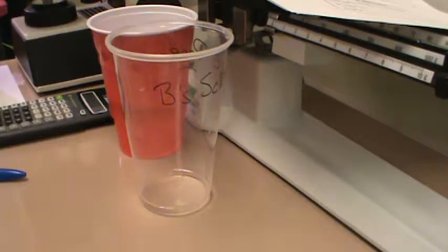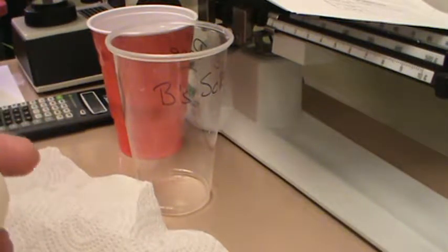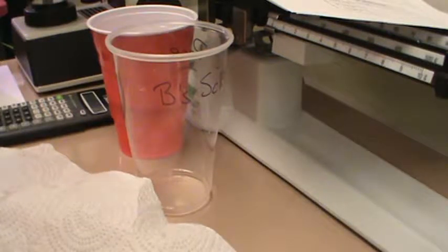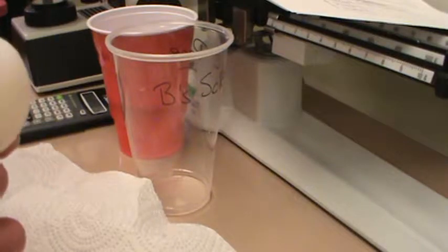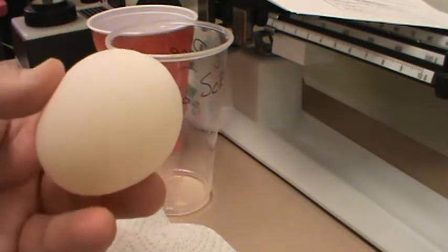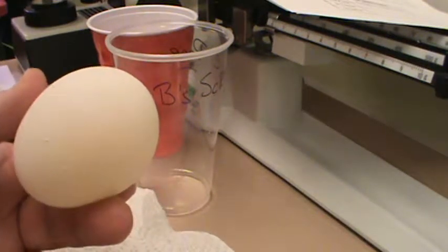And my theory, because I've never done this experiment before, was that the yolk and the albumin had been liquefied in a reaction with the vinegar, and I think I've stated that. In doing some further research, come to find out the yolk and the albumin, the white part of the egg, should still be intact inside, and then it's just this membrane on the outside that's absorbing the water.